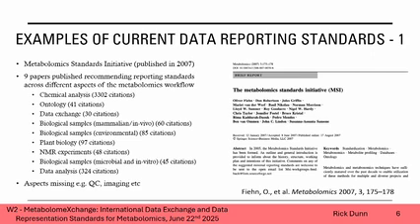Now, these are now 18 years old. There are aspects missing. There's no discussion about QC, for example, and the use of QC samples. No discussion about imaging, etc. But they have been around for a long time.